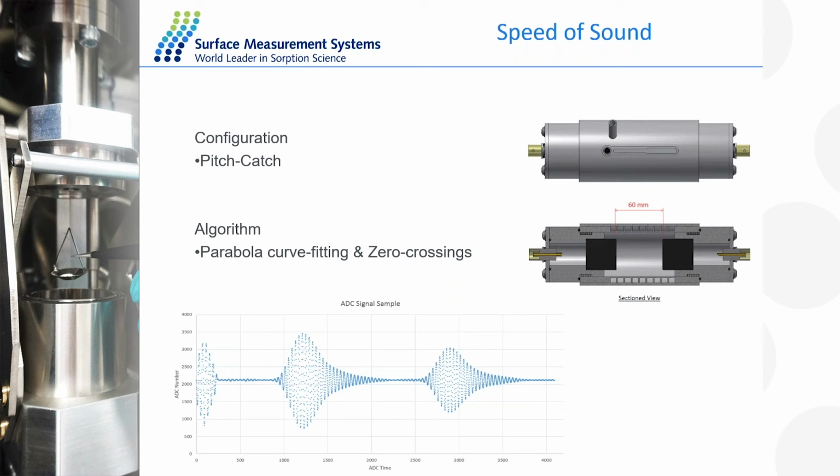We couldn't find one on the market, so we developed one on our own. Our sensor, which is called a speed of sound sensor, uses time of flight. You use the time of flight of a wave that we bounce between an emitter and a transducer. What we measure is the time of flight of a carrier gas and the time of flight of a carrier gas plus solvent.